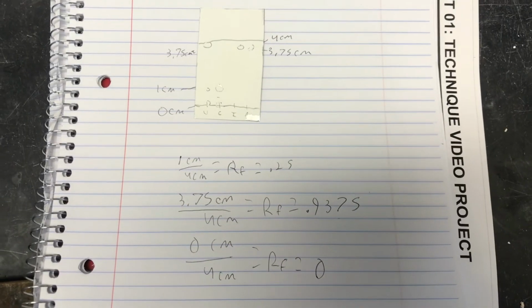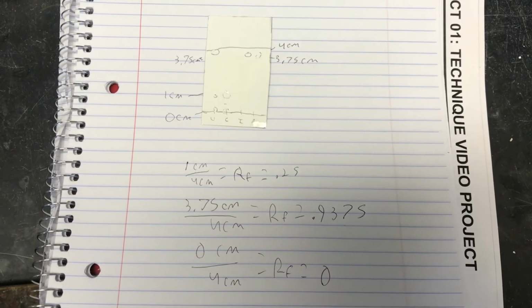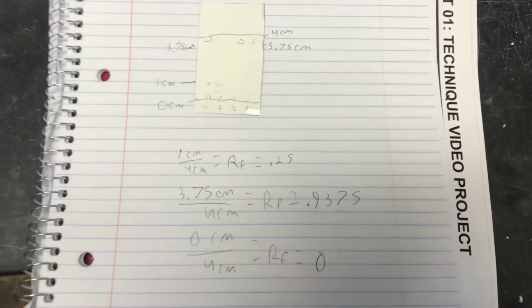So basically, we can tell some things about what it could be. I actually do know what the unknown is, so I can show you how it is somewhat consistent with what it actually is in just a moment. Alright, so we're going to real quickly go over exactly how we can analyze this.